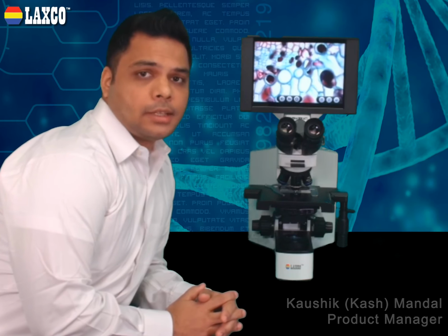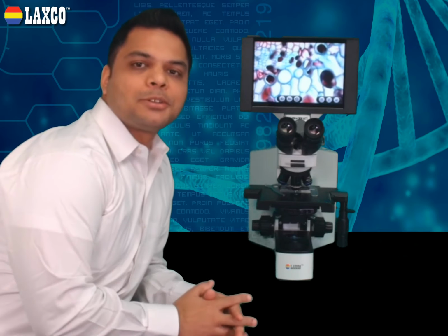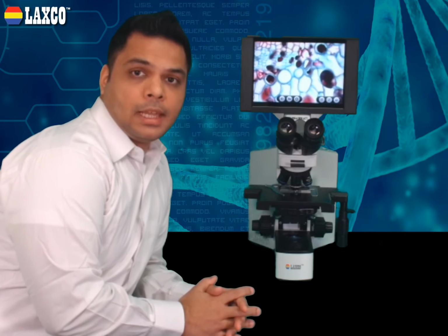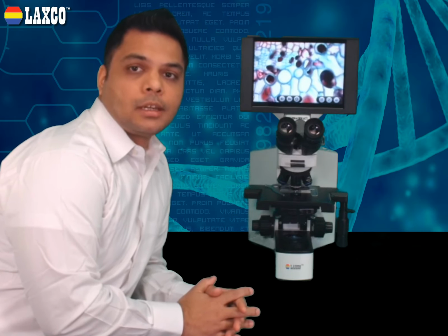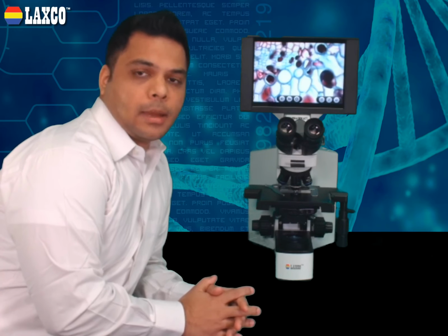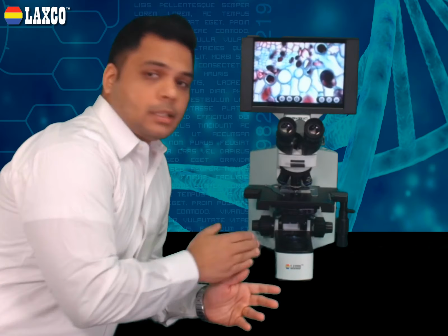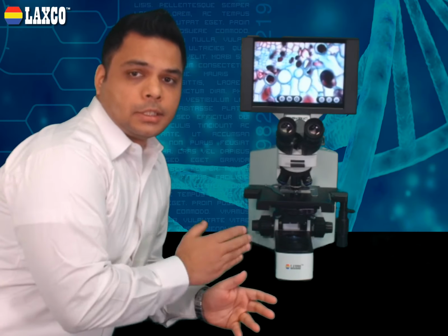Today I'm really excited to talk about our latest SeBa microscope system. Here I have the SeBaP4B. It combines a high-end compound microscope, a camera, a touchscreen, and software. All in all, this is a fully integrated system.